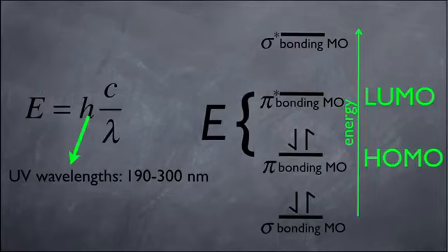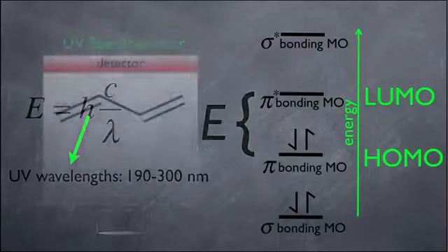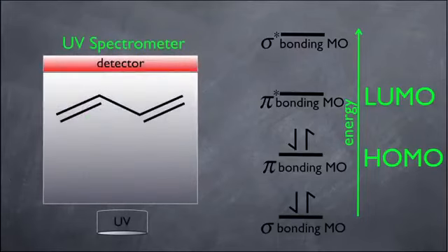So what am I saying here? What does this all mean? Let's go back here. Again, we shine various UV lights, with certain wavelengths, at our molecule. Remember, the conjugated system will absorb light at UV wavelengths. And remember, we were trying to figure out why that's so. Well, what happens is one of the electrons here in the HOMO gets knocked up here to the LUMO, all right?